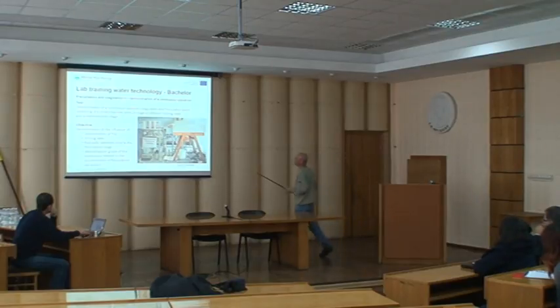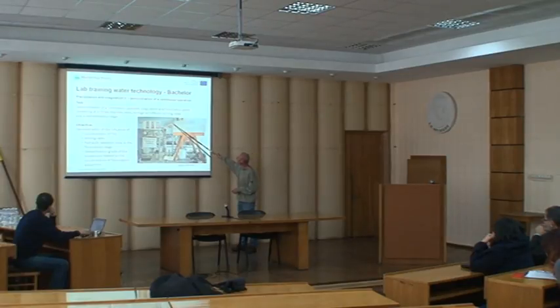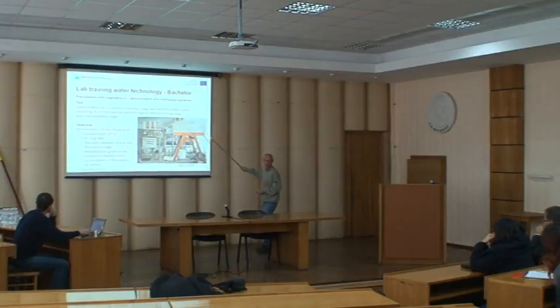And here the concentration of TSS has been demonstrated, stirring rates and so on, and hydraulic retention time for the flocculation and the sedimentation stage. So one has to make sure that the particles at least have to sediment at this point. Okay.